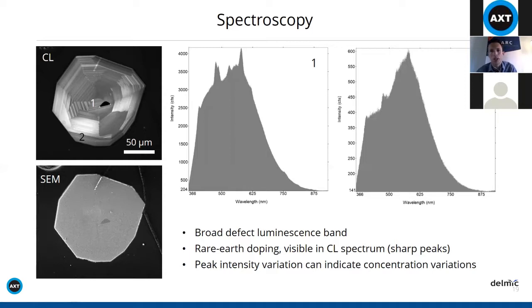I don't think angle-resolved imaging adds a lot in the case of zircons. I think nice hyperspectral imaging and intensity mapping is normally enough, unless you are looking at a specific defect type, but I think it is probably more interesting in other mineral types.